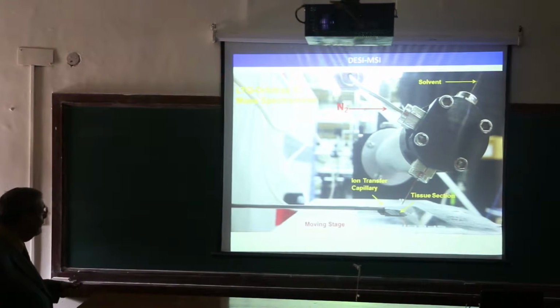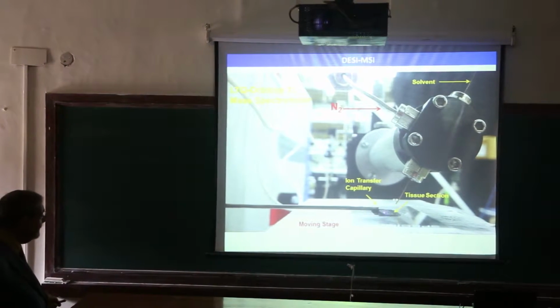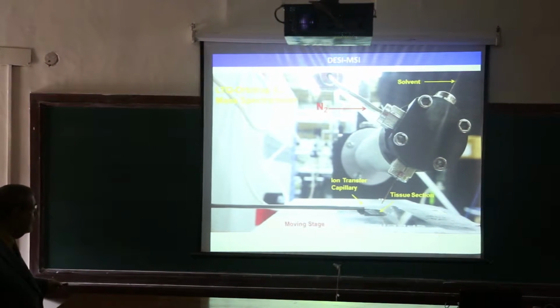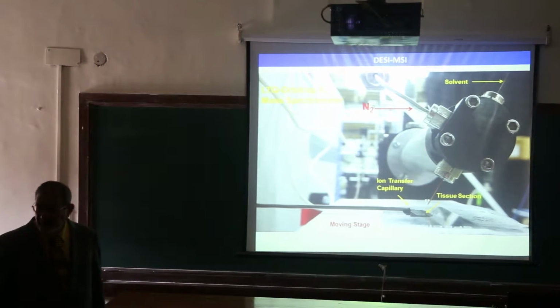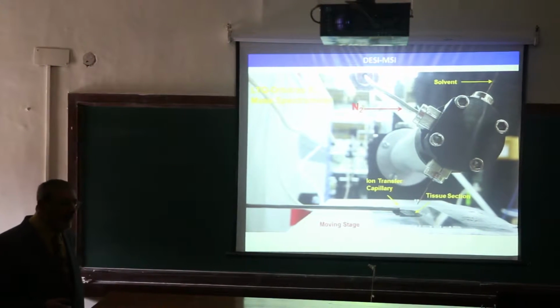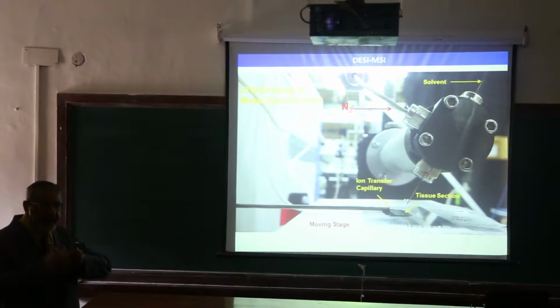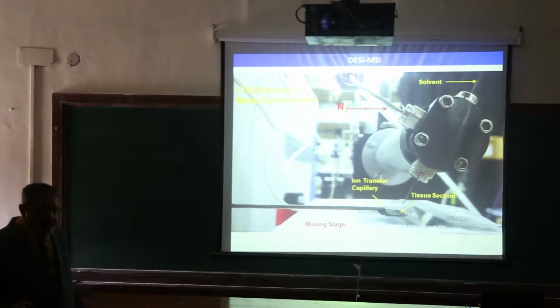Comes a solvent. I told you what the solvent is. This is a piece of tissue that's been cut up. This tissue is on a microscope slide, on a glass thing. The tissue is about 15 microns thick. It's easy to make it flat when it's that thin.